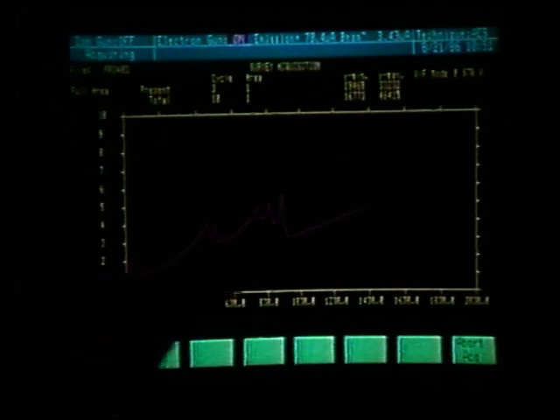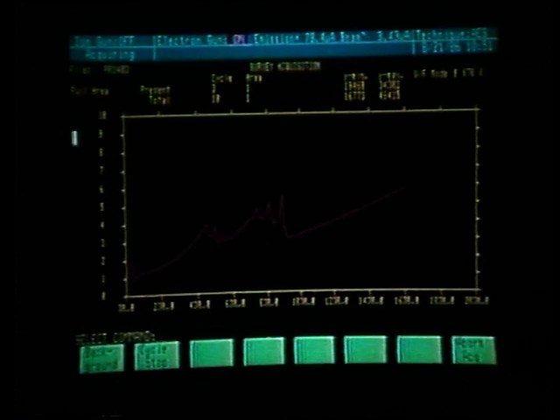Also, the signal to noise looks good, so we will not spend the full 5 minutes or go the total 10 cycles. As we did with the survey scan, let's do a cycle stop at cycle number 5. This can be used to evaluate what is happening at the interface.